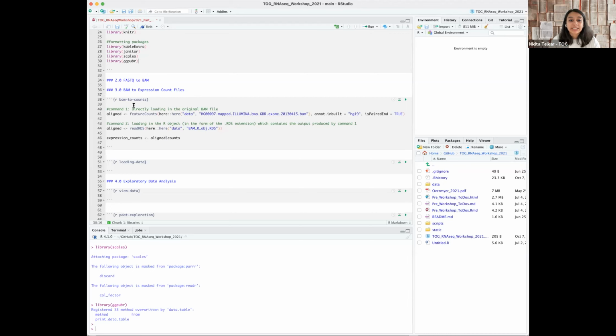But the expression data set that we'll be using is one that I've already formatted from a paper. And it looked at COVID status between a couple of patients. So we're just going to explore that data set a little bit more. So that data set is the GEO data set.